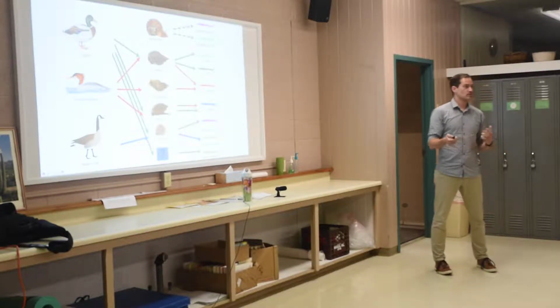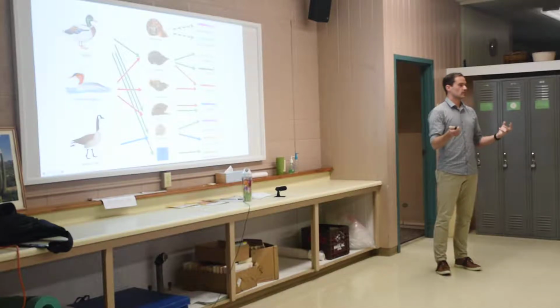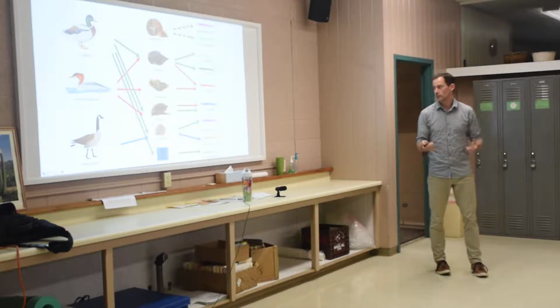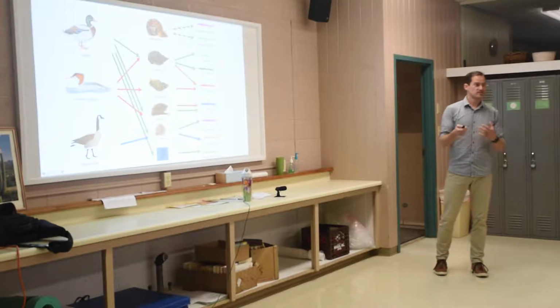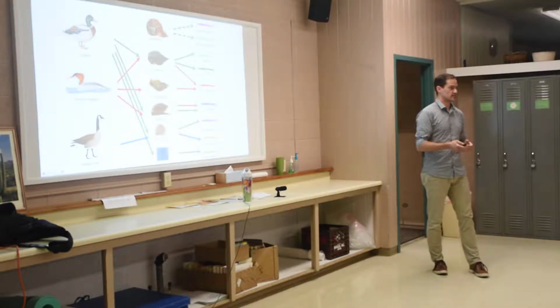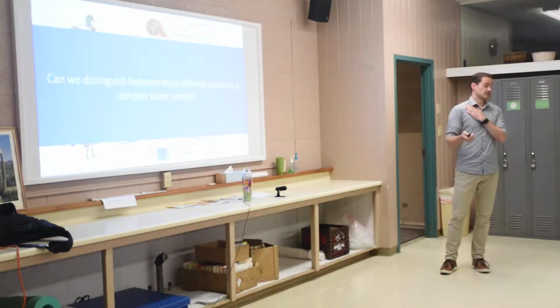Swimmer's itch. And so the question became one of higher resolution. We needed higher resolution and more specificity in our testing to be able to answer bigger questions and more important questions. So we decided that we wanted to design qPCR tests that would let us identify between these different species of parasites in a water sample. So we asked the question, can we do that?